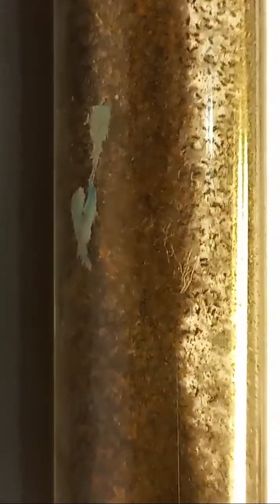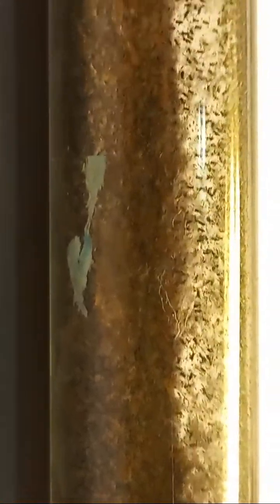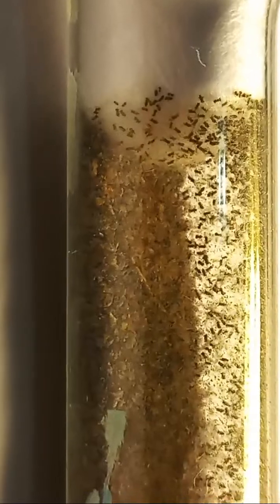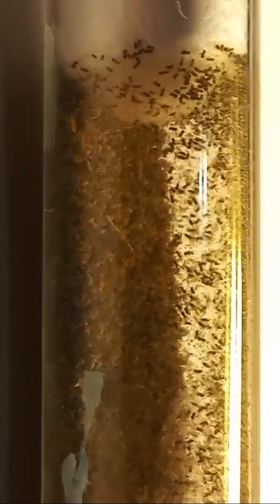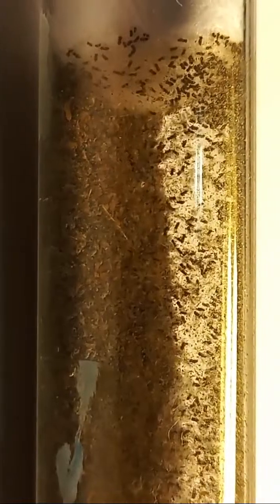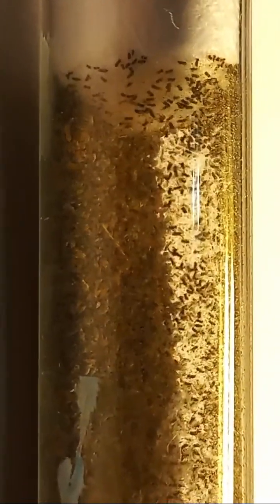This is a short introduction of Trichogramma egg parasitoids. This is my short video about Trichogramma just online, because they are crawling around and making the glass tube dirty with poo and pee. And later it will be difficult to show them through the glass. My interest is purely scientific.